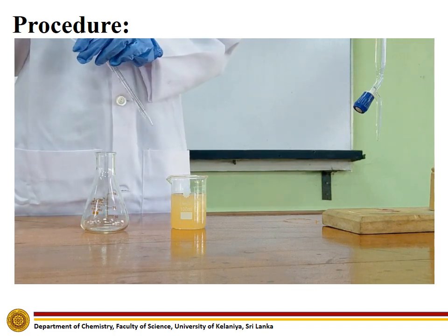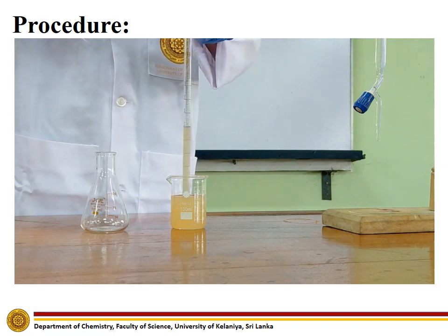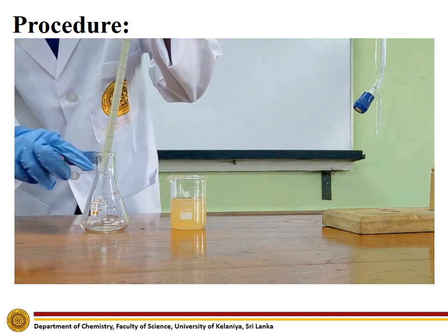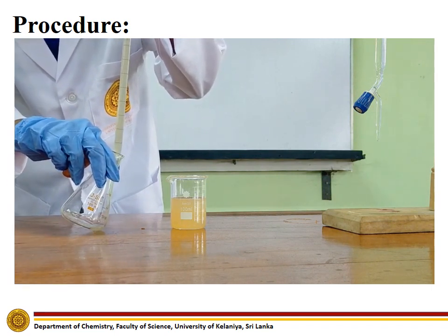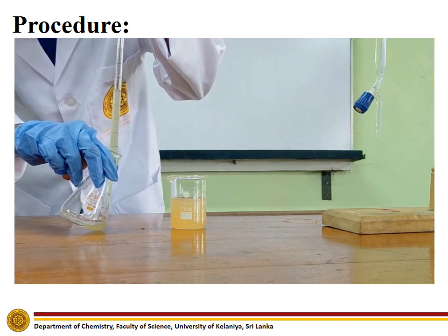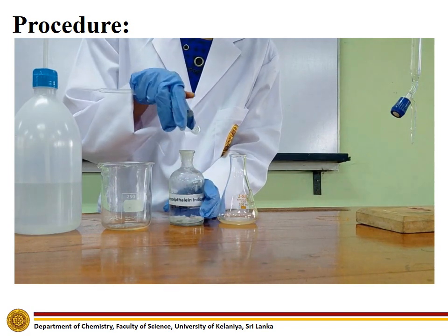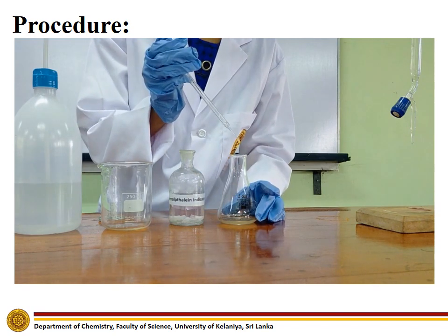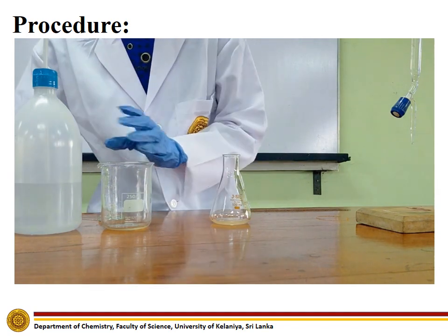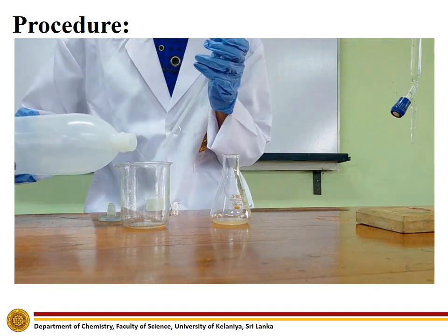Using a well-washed pipette, transfer 5 ml of vinegar to the titration flask. Next, add a few drops of the phenolphthalein indicator. Also add about 10 ml of distilled water in order to dilute the natural color of the commercially available vinegar.